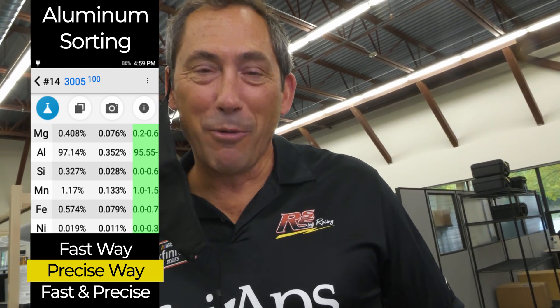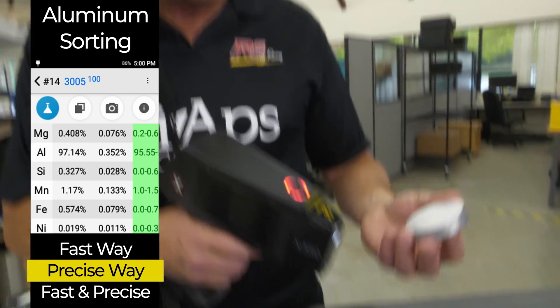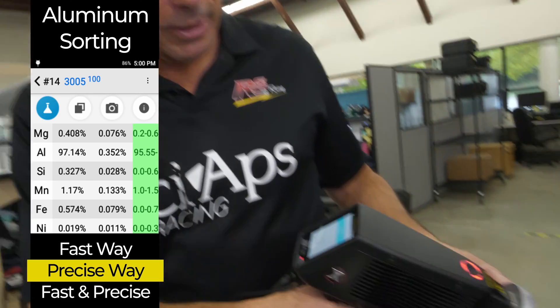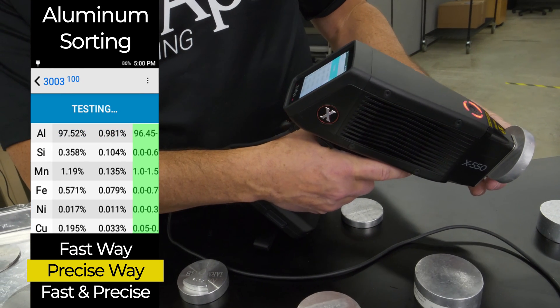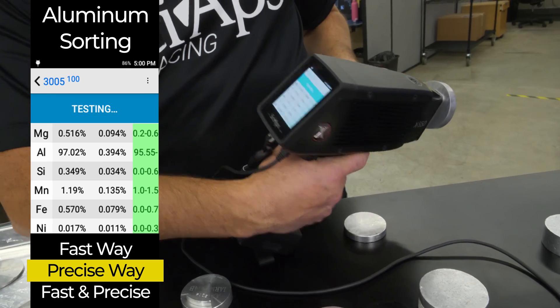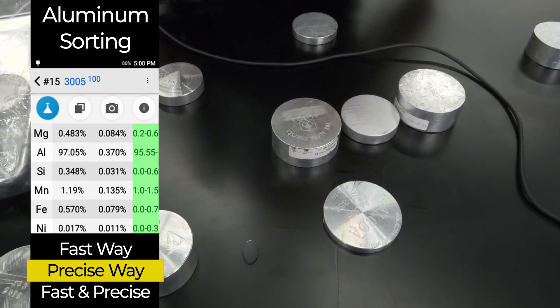Not just 3003 — if you encounter 3005 or 3004, you want to measure that magnesium. That's a great example. With an old x-ray gun this measurement would have taken a minute, but look at this: one, two — switch beams — one, two, three seconds. There's your magnesium. There's your perfect match: 3005. That's the more precise way to do it — it takes a little longer, but it's more precise.